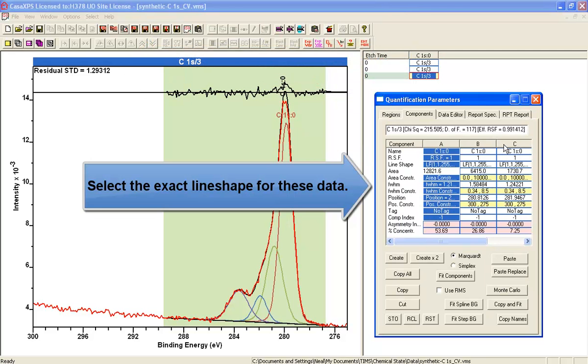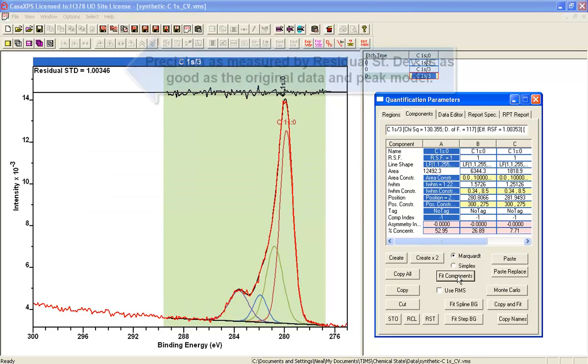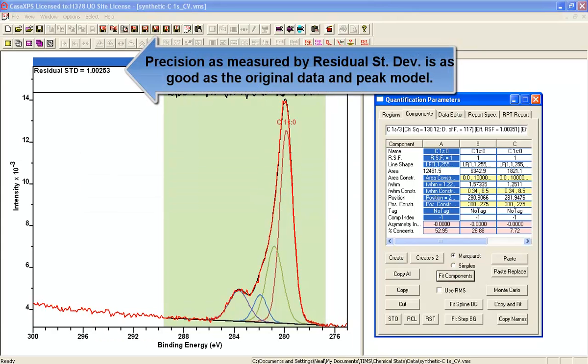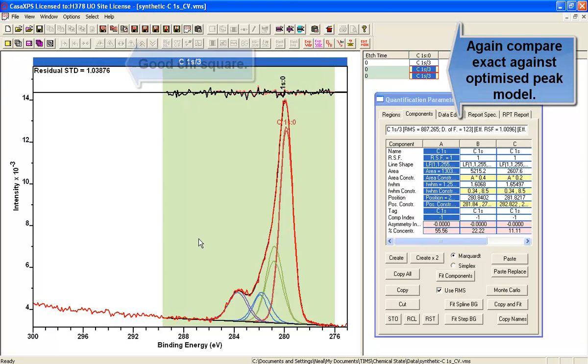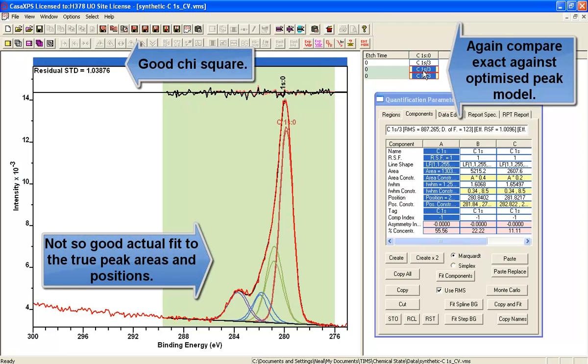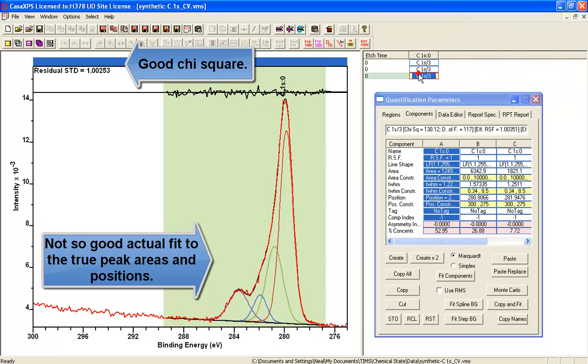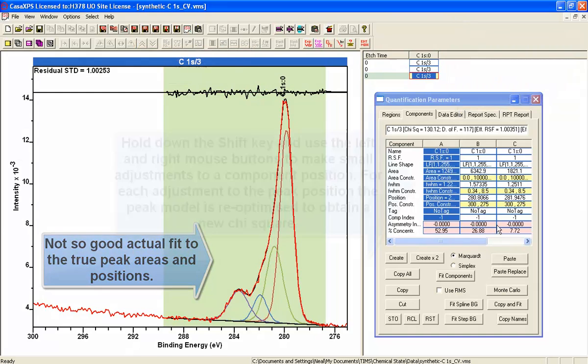So now let's introduce the original line shape and fit again. And now we have good precision. This is not unexpected. So how well did the peak fit do? Again, not particularly well, even though the residual standard deviation suggests that we really have done quite a good job.